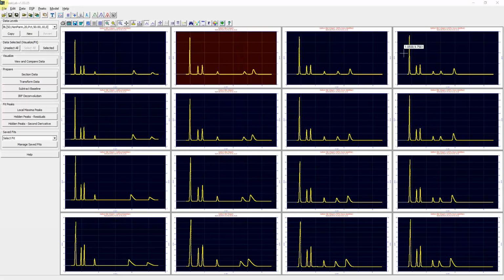In this video, we will demonstrate an experiment that required close to a month to analyze with PeakLab's predecessor. We will accomplish a much more comprehensive analysis, and we will do it in minutes.